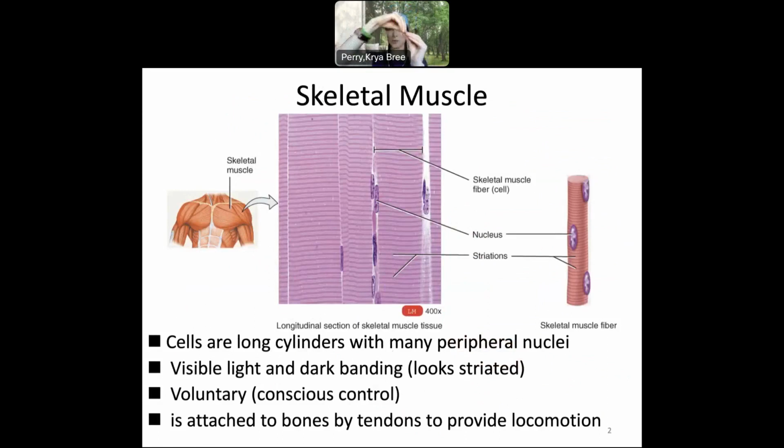So there are these really long muscles, or these really long cells, sorry. And so this is what's called a longitudinal section. So here, if I take my pen, here's my muscle, and it's like I cut this way. I did a longitudinal section, and I'm looking into that marker. If I cut it in half, okay, I'm looking into it.